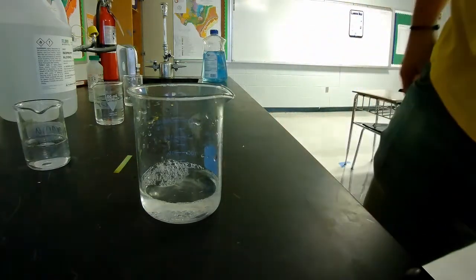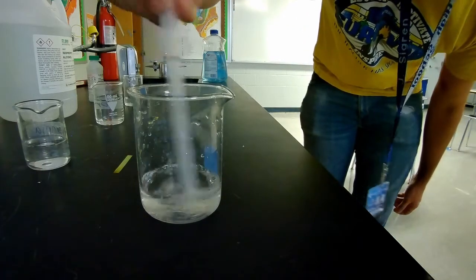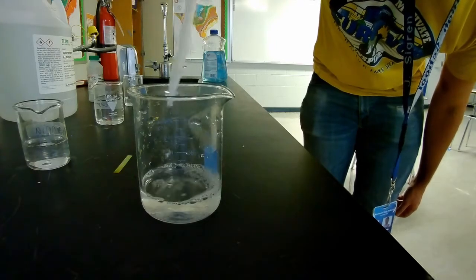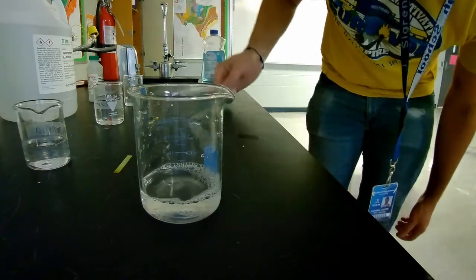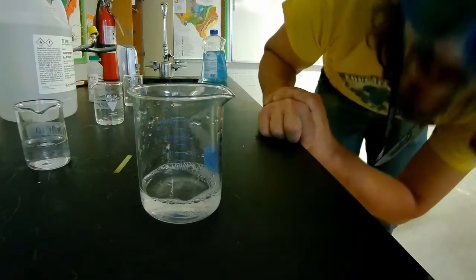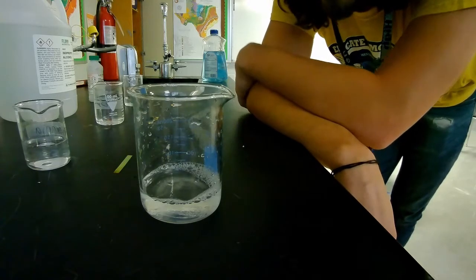Well, wasn't that exciting? You can give it a slight stir here. A little bit foamy. That might have just been from the ammonia in general. Well, that is one of the things about science, is that not everything always blows up.